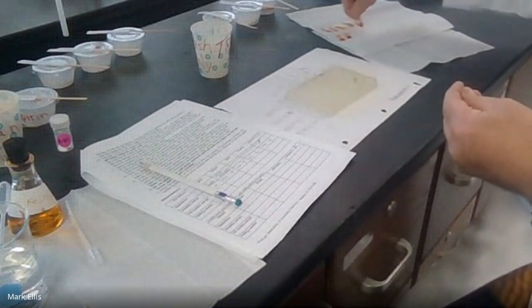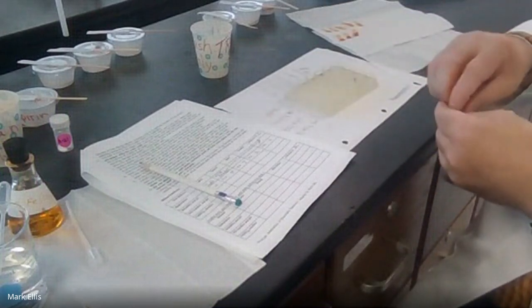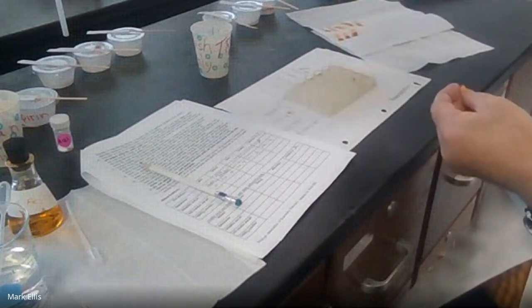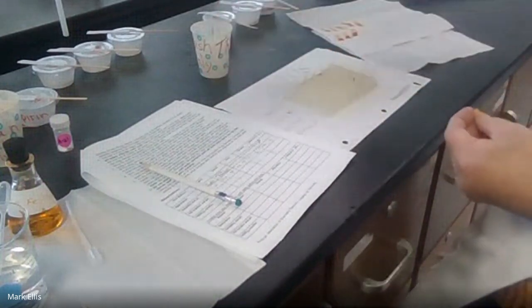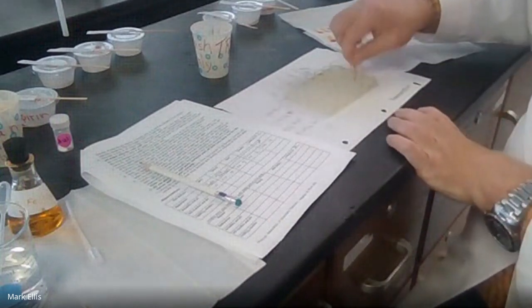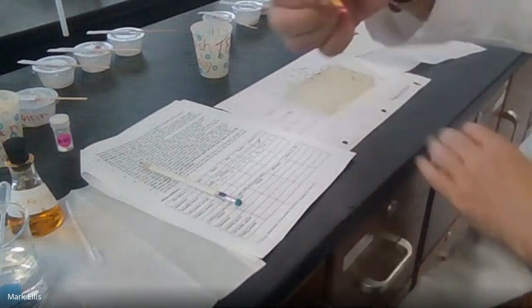Dip it in, definitely a dark red, definitely a 1. Excedrin, definitely a red, definitely a 1. And my unknown, dipping it in, definitely red, definitely acidic.